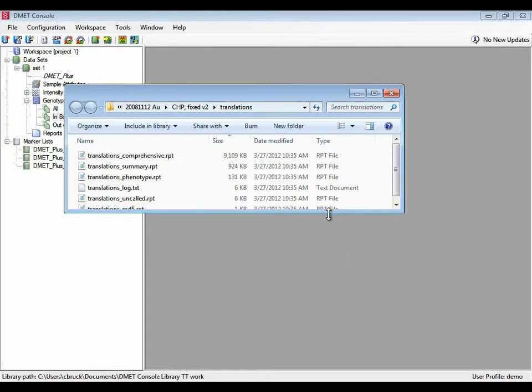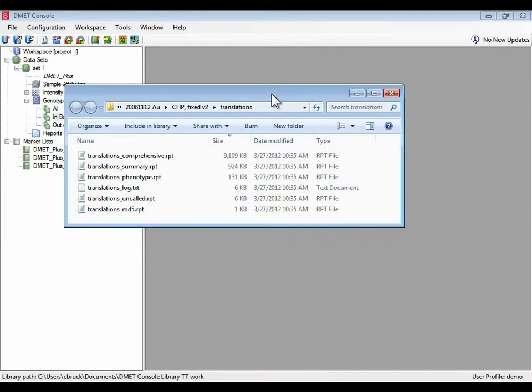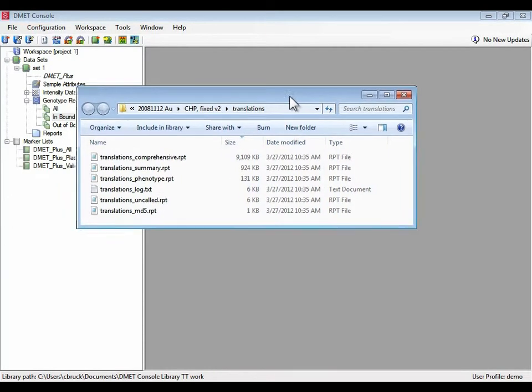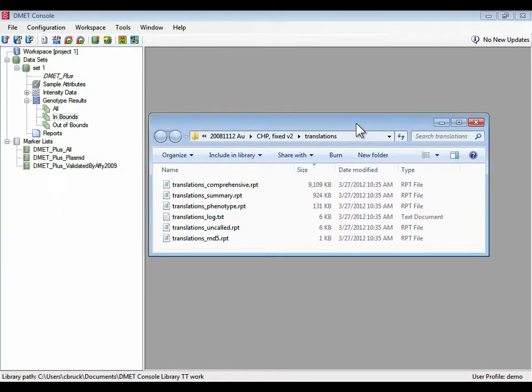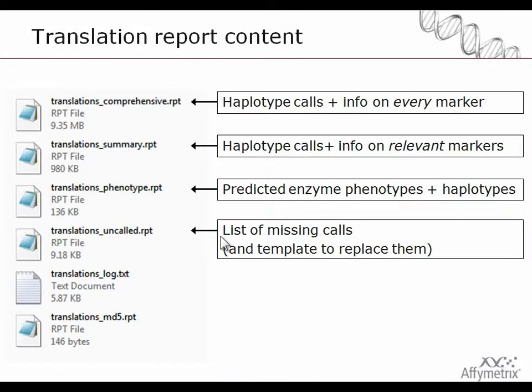When the translation operation completes a window will open showing the files that have been generated. Unlike the cell intensity files and the chip files and sample files, translation results are not managed within the workspace.